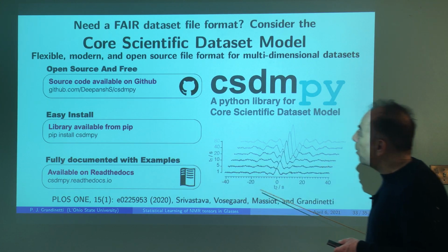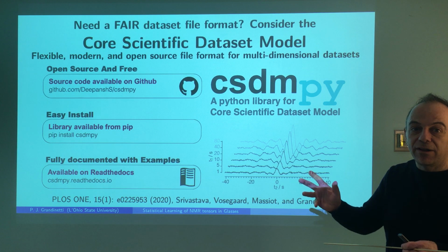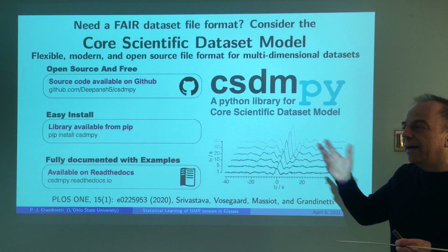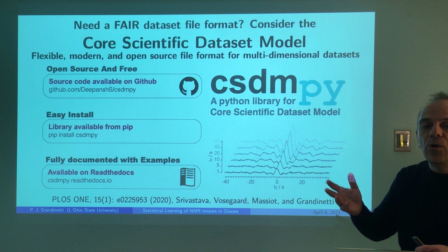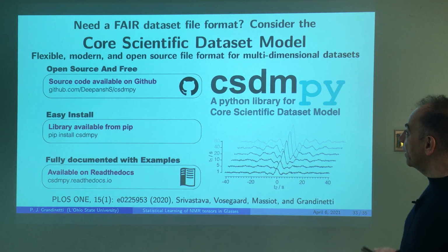Additionally, during the whole process, we needed some kind of file format to store all of these multidimensional data sets and their inversions, and we realized that file formats such as JCAMP were really old and not modern and not really working the way that we needed them to for the kinds of 2D, 3D, 4D data sets.